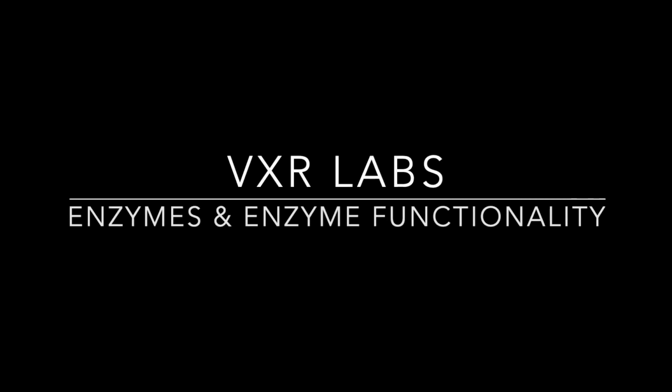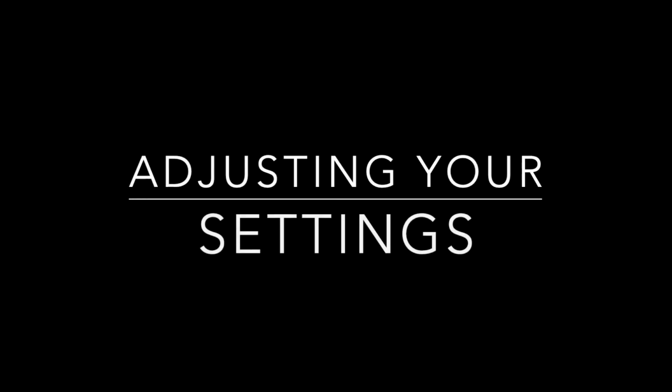In this video, we'll take you through some of the resources available inside the VXR labs for enzymes and enzyme functionality. They have some things in common, and we'll point out some of the equipment that you have in there. Let's first begin with how you adjust your settings when you first arrive in the lab, because you may, for example, find yourself at a different height than you would expect when you're working at a laboratory table.